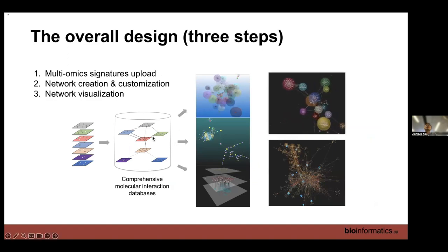Network analysis by itself is almost, how to say, an art, because most people are just using visualization plus enrichment analysis to get some feelings. So we understand that network analysis is important, but we also want to engage users, to use your biological background to really see which one is more important. So we spend a lot of time making it 2D, 3D, and trying to make it structurally more meaningful and intuitive. And you can see some of them is actually the default. If you just go there and do a little bit, you'll get a similar result and a lot of good visualizing results. You can make it more art if you like.